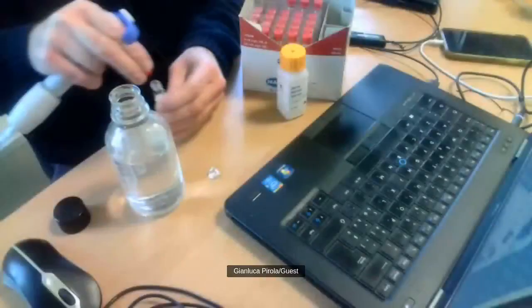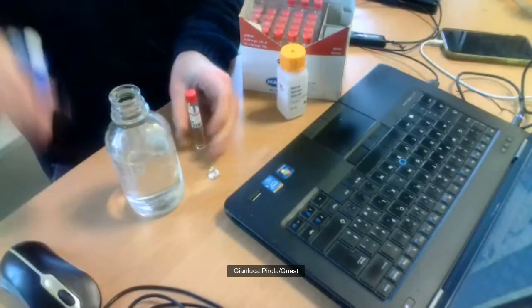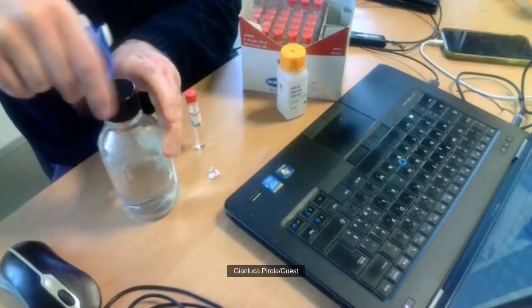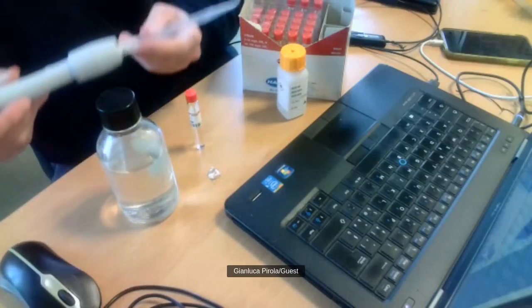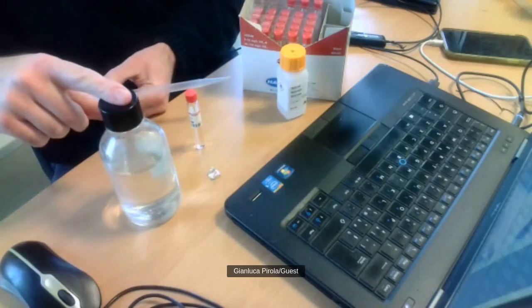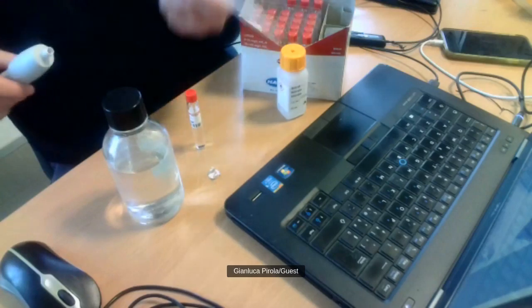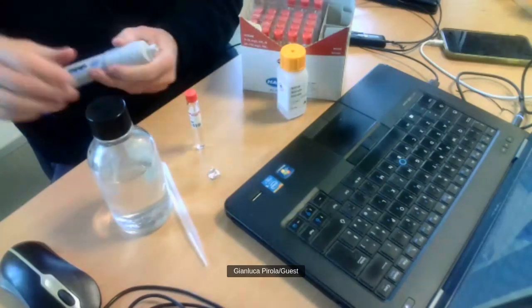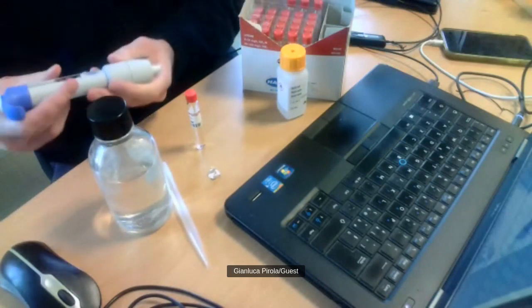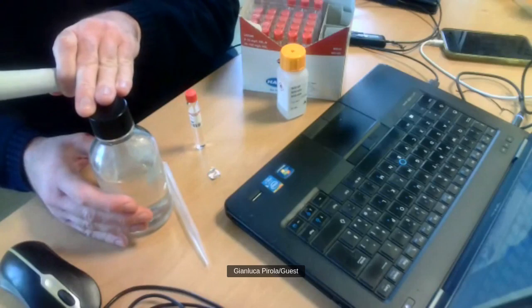Unless you are using the same. For example, now I have dosed the sample. The next time I have to dose the sample, I can use the same tip. I can put it here and use it all the time to save tip, if you want to save tip, and use it just when dosing the sample.